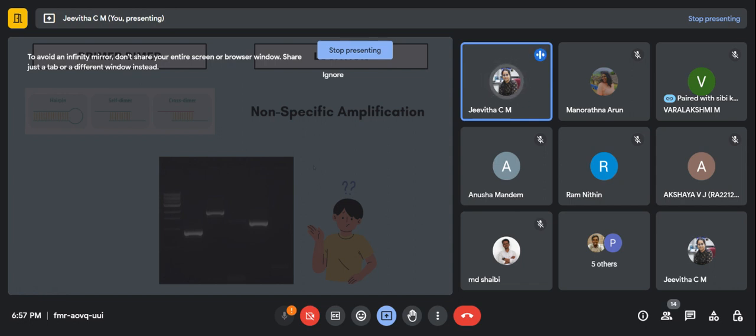There we can have more gel pictures showing where errors have occurred and how we optimize them. We can show the various results and outcomes you get when you go for PCR, and what things we have to change to get good quality data. All those things we can look at in our upcoming sessions. And these are all the basic things we have to look at.